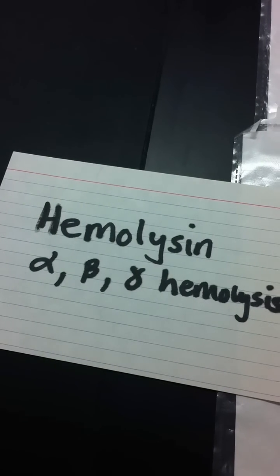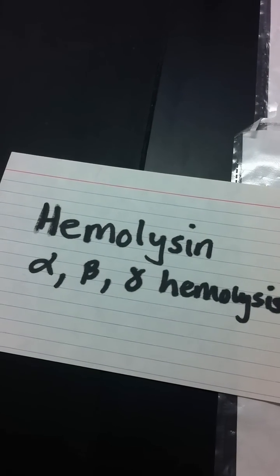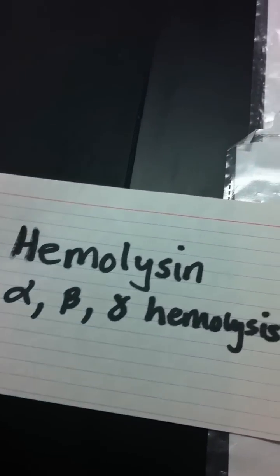Okay, hemolysin test. You're looking for Alpha, Beta, or Gamma. Alpha hemolysin will break down the red blood cell and part of the hemoglobin molecule.